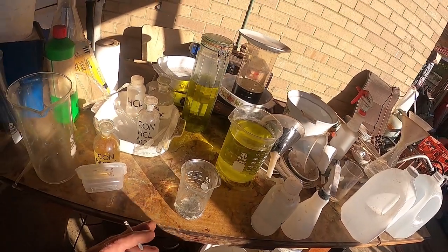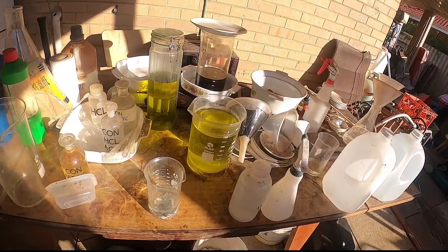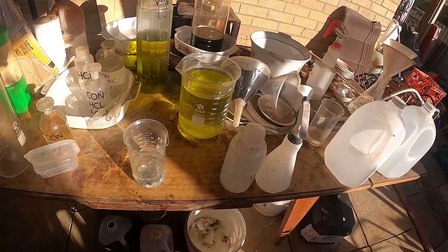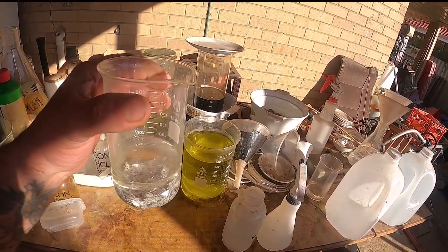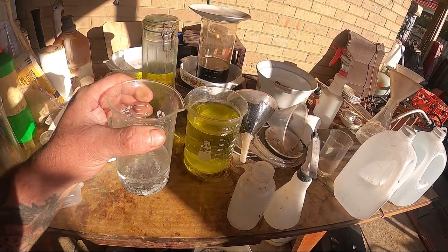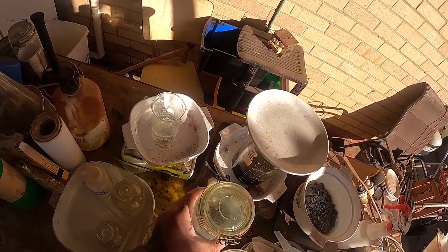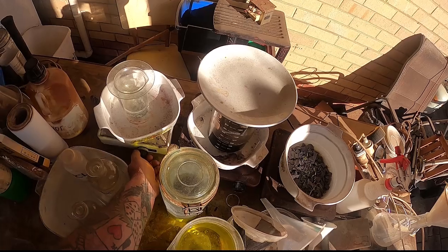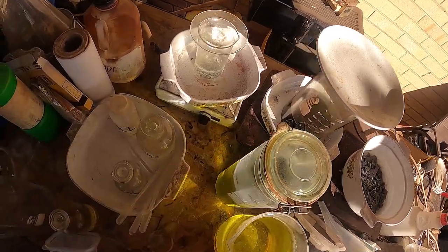Then you let it dissolve. Put it on the heat if you can — if you haven't got a hot plate, just put it out in the sun. You can see there's already a reaction; it's already starting to fizz and bubble. But I'll put it on the heat anyway. It doesn't need to be very hot.